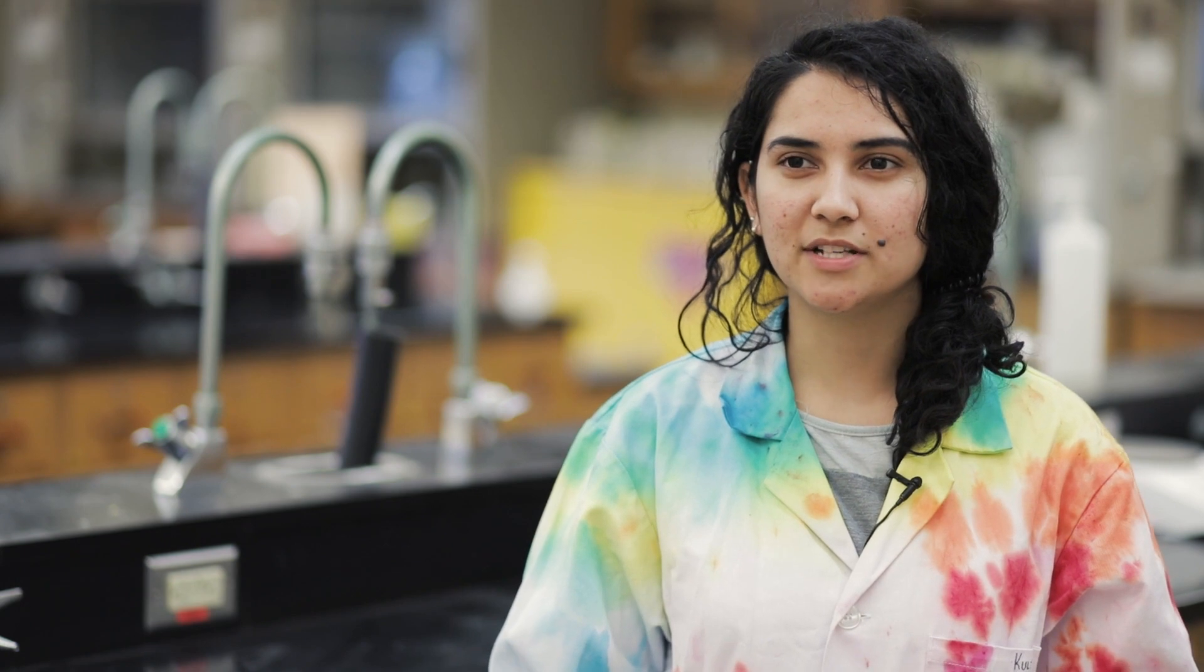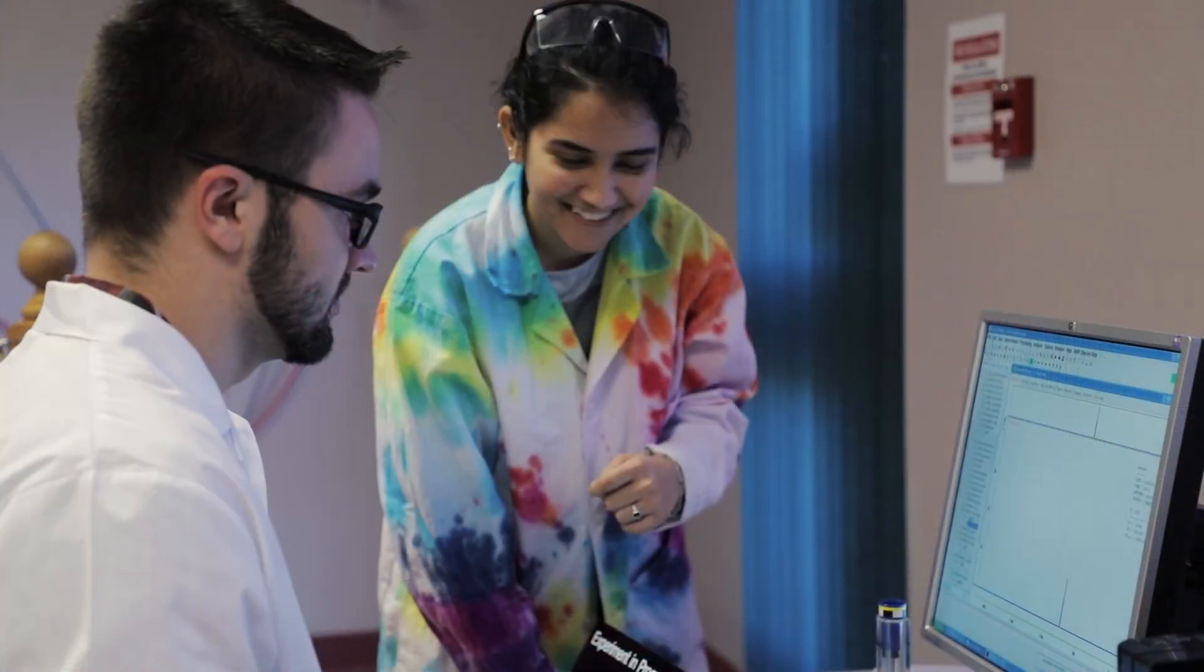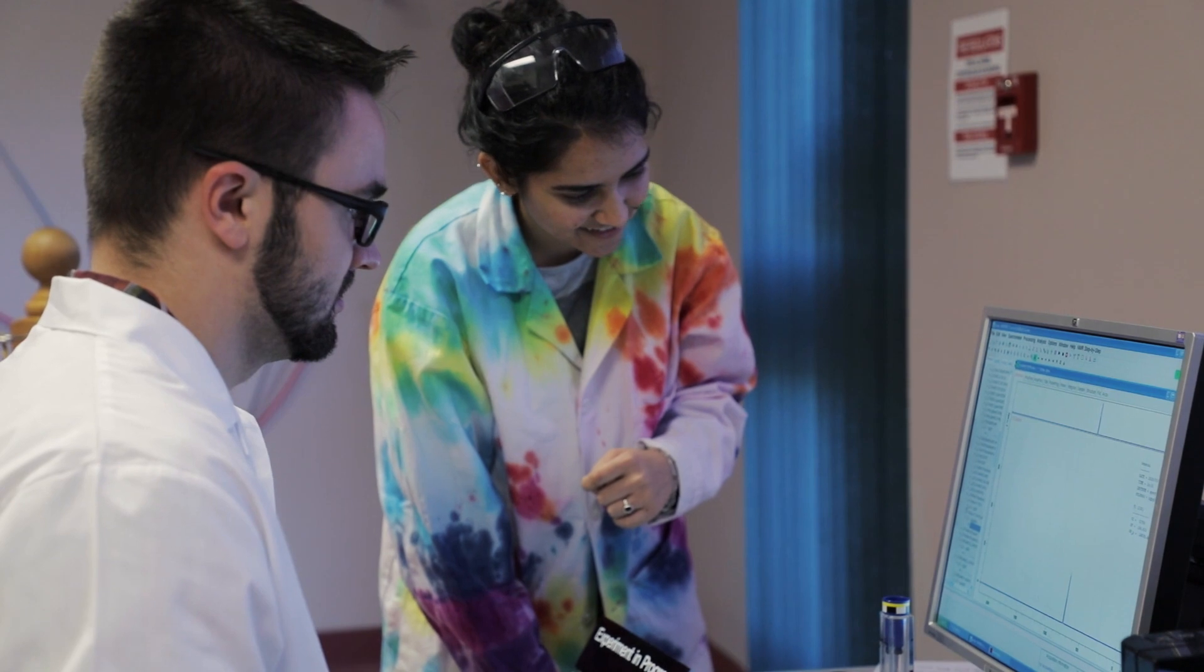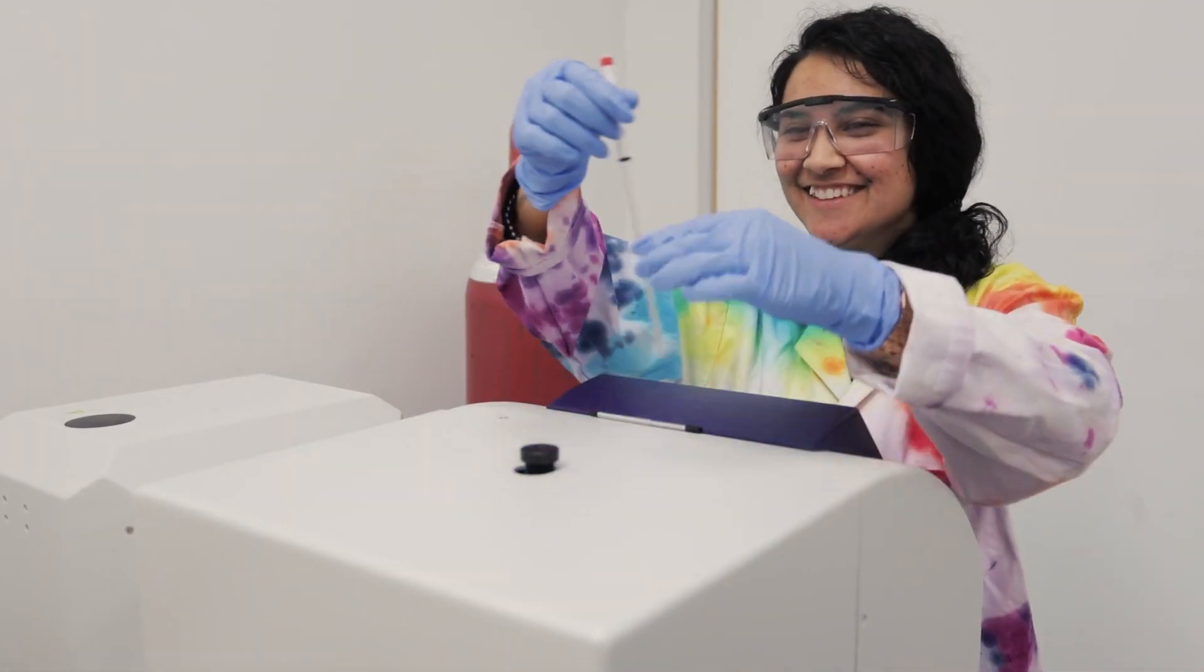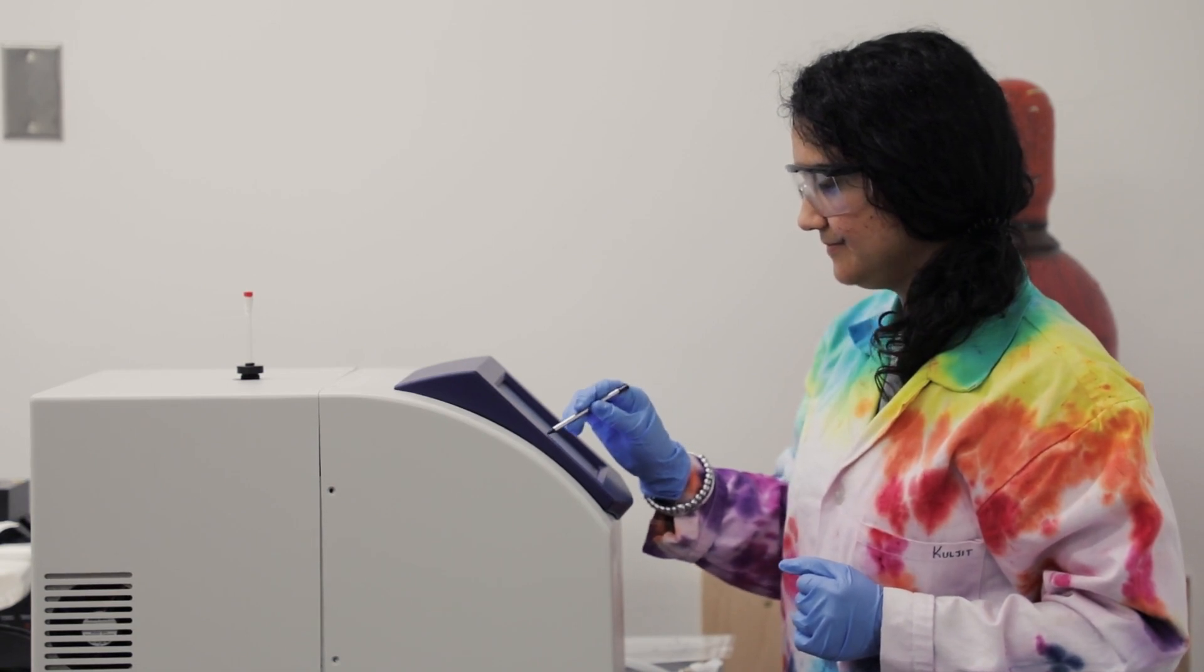And so as ESR, that's where we determine the spinning of electrons. And it's going to help me in my career because I am doing chemistry, so most of the time we deal with organic and inorganic compounds, and it's going to help me a lot. It's a very good handy tool that I have.